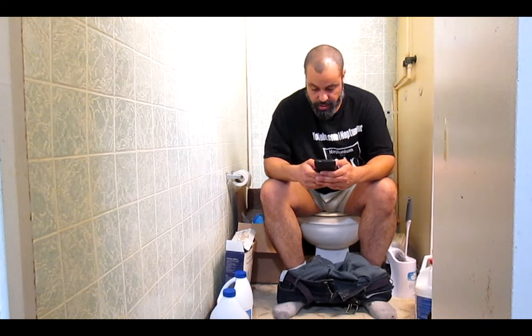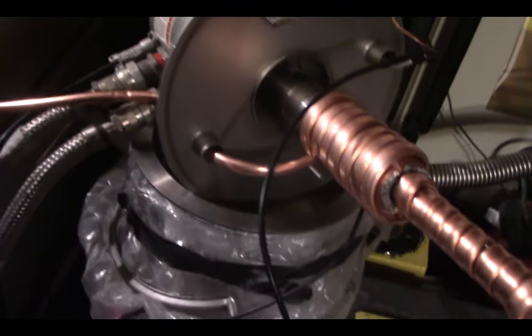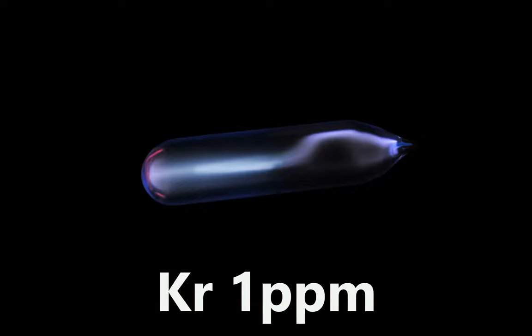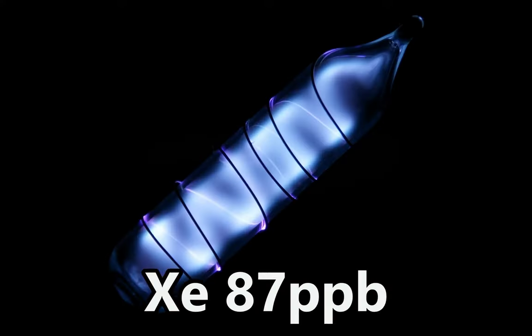When it comes to volatile and gas analysis, a few things come to mind, but I wanted to do something interesting and productive. Krypton and xenon are rare gases present in the air at about 1 ppm for krypton and just under 90 parts per billion for xenon.